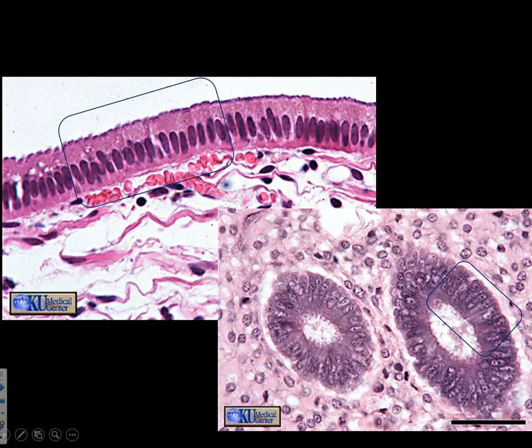All right. Once again, clearly see this is epithelial on this one. There's the apical surface. Here is the basal surface. We got a bunch of reticular tissue down here, which we don't need to worry about at this point. Same thing over here. Here's the apical surface. Here's the basal surface.